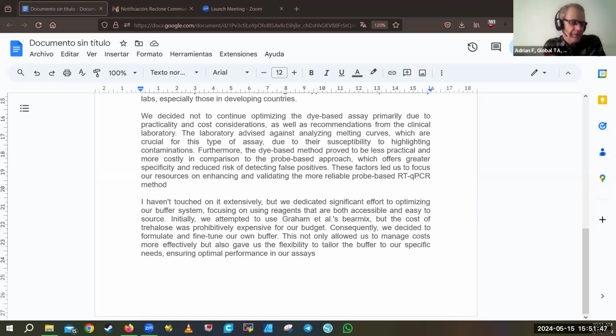If I do that, I hope to get much better sensitivity, much clearer bands than even the commercial transilluminators right now. I think it's maybe 20-30 bucks to make, and you can do it at home. It's a nice thing in case any of you is interested. The PCB board is about $5 for 5 of them, so that's good.